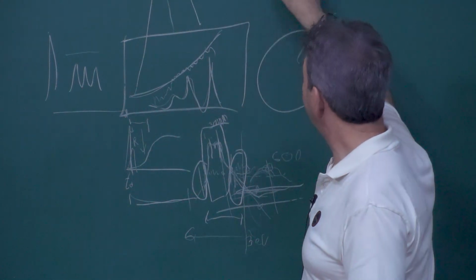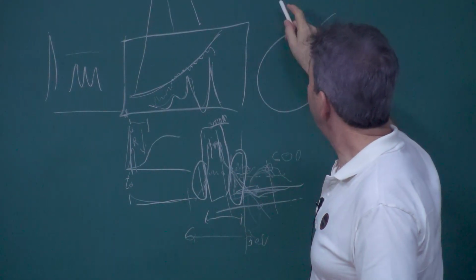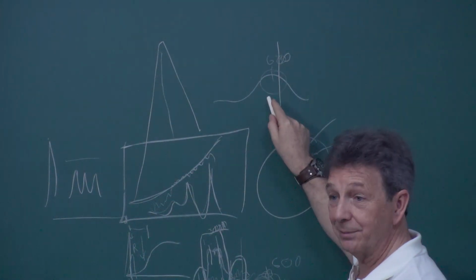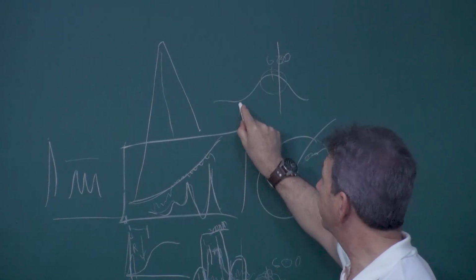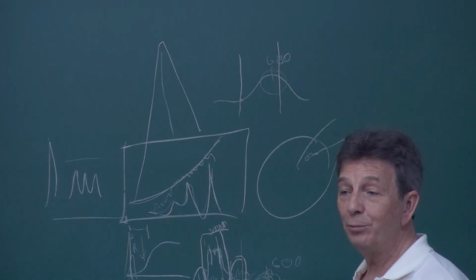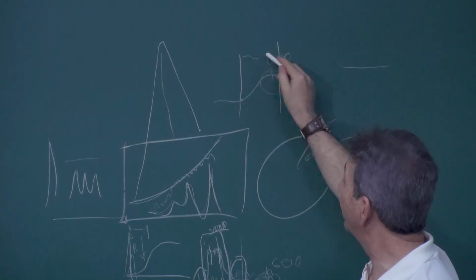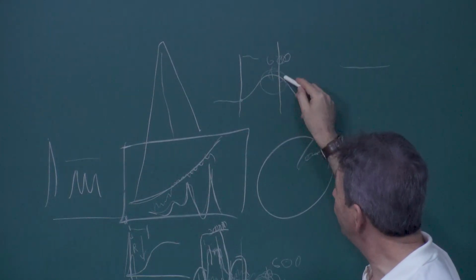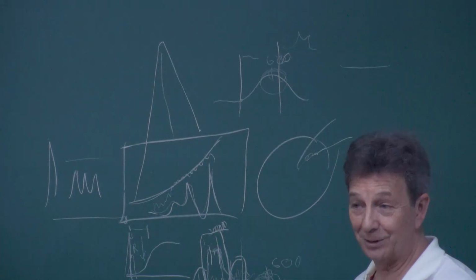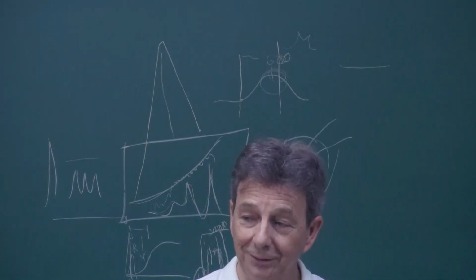The spectrum will be like that. It absorbs at about 633, 600 more or less. So you use the 633 laser, and then this partially reduced molybdenum shows nicely in the spectrum. But typically you work with the green laser, 500 over here, and this sample with partially reduced molybdenum has a very weak Raman signal, so you get a very poor Raman spectrum. But when you are using this laser, you get clear bands associated with this partially reduced molybdenum, because you are in resonance. So it can be misleading, but when you know it, you can use it.